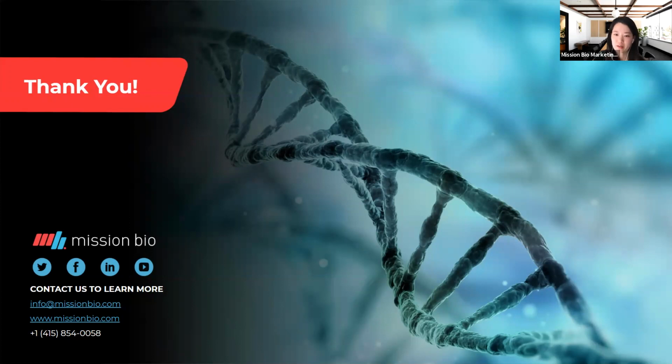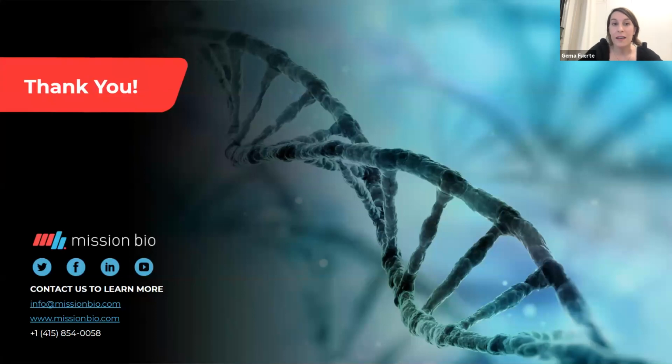Oh, here's the one. Is the Tapestry software free, or is it included in the platform? I'll take that one. Yeah, it's free. So you don't need to pay anything additional to analyze your samples. It is included in the price of the reagent. So you have access to all the software packages that Kelly talked about, Pipeline and Mosaic, as part of your assay. You don't have to pay additional.